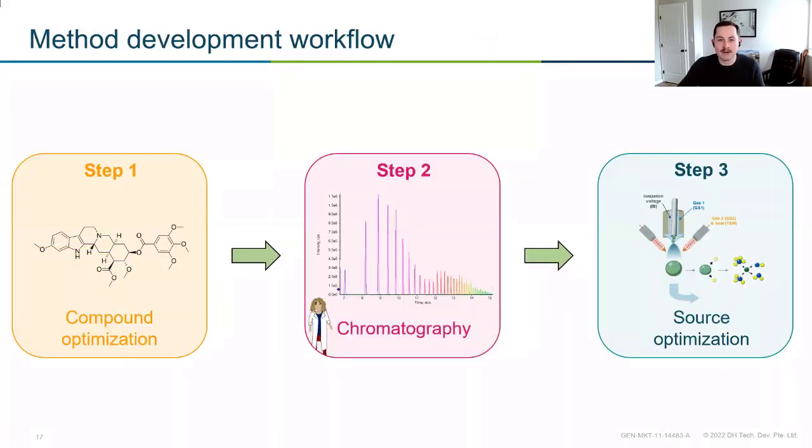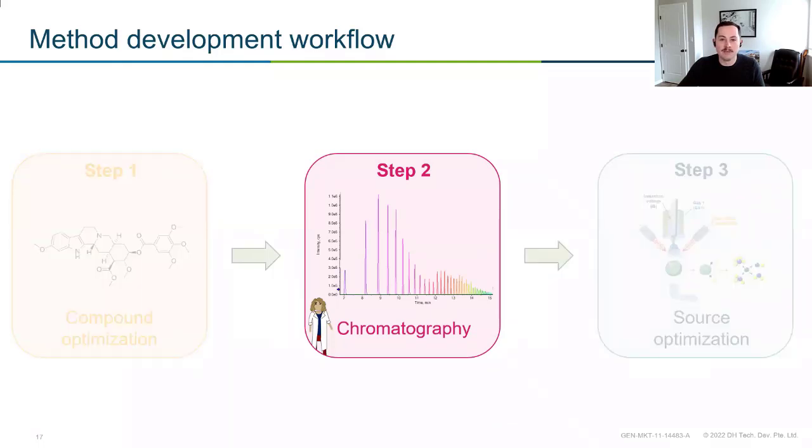So we set up our compound optimization. Our next topic we need to cover is chromatography. So this is really important.